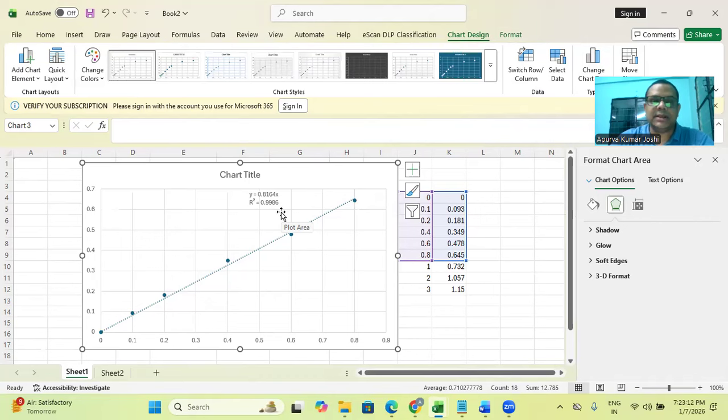You shouldn't rely on that data, and you have to repeat the experiment altogether another time, so that your pipetting skills are accurate, and you're doing the experiment properly without introducing manual errors. So you've got to practice until you're able to achieve an R squared value as close as possible to 1, above 0.99. This is fairly okay.